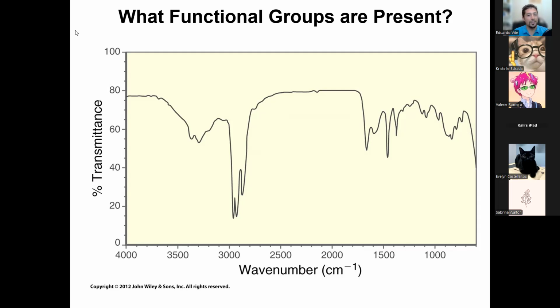And they're roughly in the same region as an alcohol, so that tells me it's a strong polar bond. And the peaks are weak, and they're to the left of the stalagmites. So that's roughly where you would expect an amine. There's two of them, so that must mean that there are two NH bonds. So that is a primary amine. This is an NH right here.